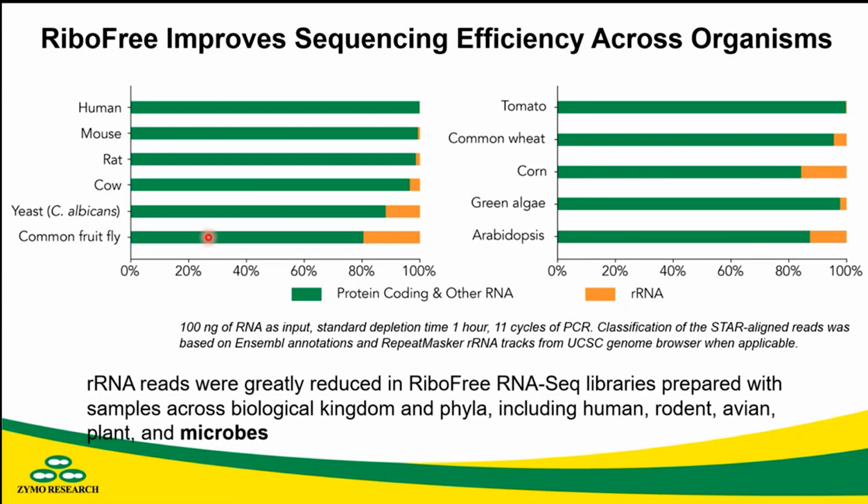And looking at these libraries prepared from samples across a wide variety of biological kingdoms and phyla, including human, rodents, cow, avian, and plants, insects, and of course, microbes.